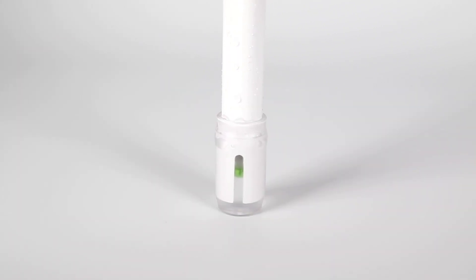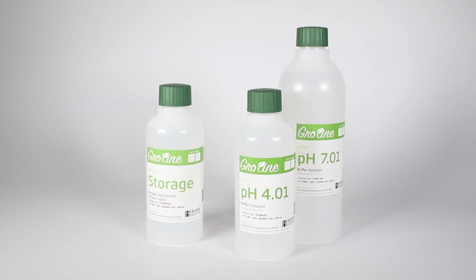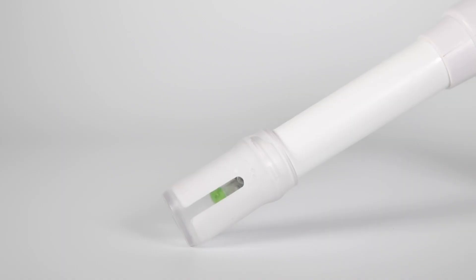If you don't have any storage solution, calibration solution can be used to hydrate the bulb until you purchase storage solution. For the fastest readings and to extend the life of your probe, always keep your probe in storage solution when it is not in use.